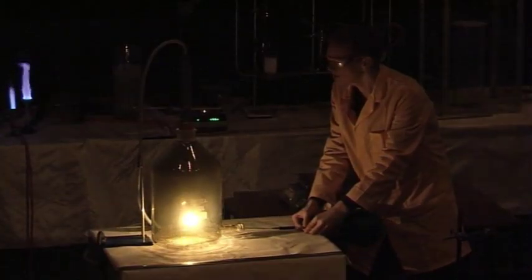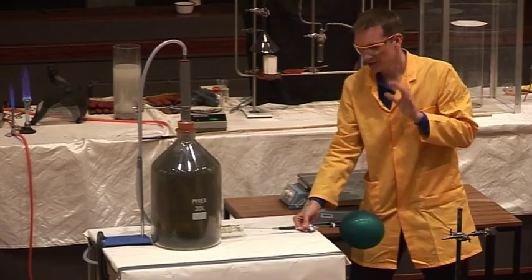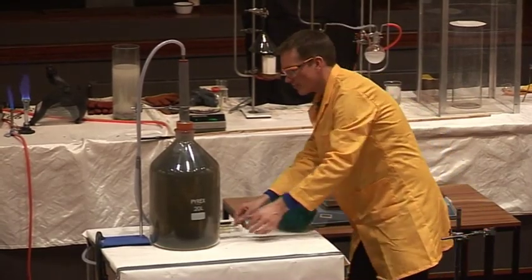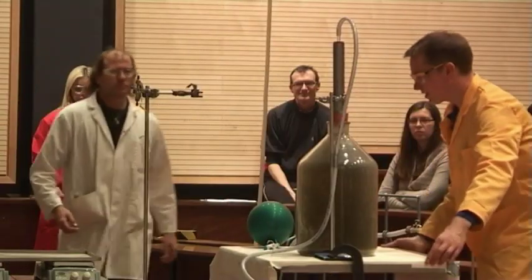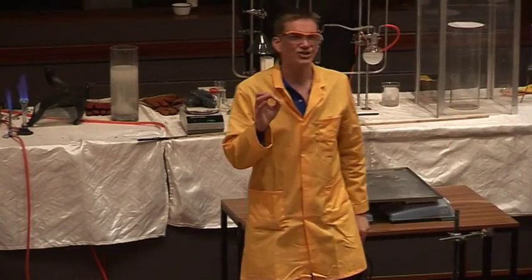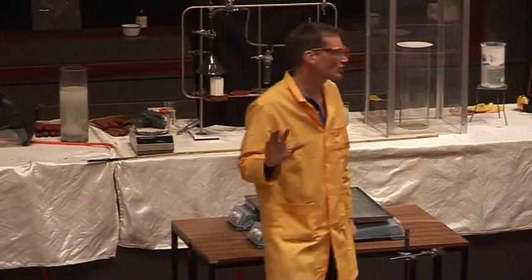If we have the lights up, please. So you can see all the carbon that's forming here because the reaction isn't really complete. So it's a very smoky reaction, but nonetheless, this is a reaction involving no oxygen at all. Okay, if we wheel this one away, please, and we'll swap it. So that was a hydrocarbon spontaneously burning in chlorine. Okay, no oxygen at all.